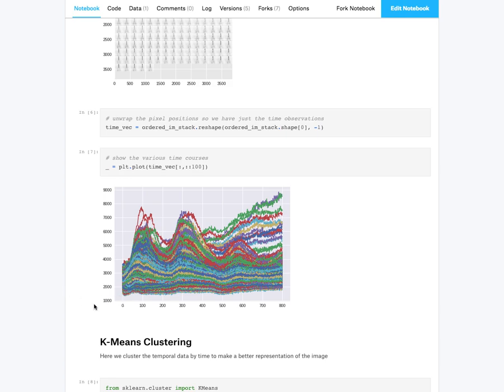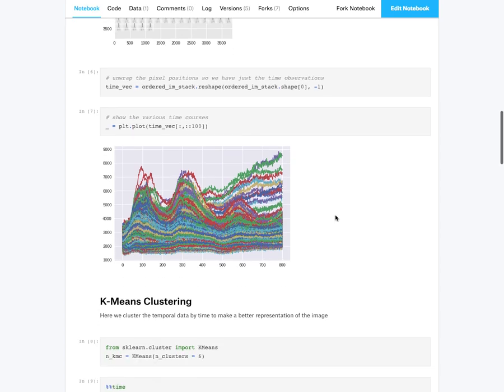And so here I think we just show the point number, but obviously this translates to hours. If you're looking at something like circadian rhythm, you want to know which curves are in sync with each other, which ones have a phase delay, because that probably means this circuit could be activating another circuit, and which are doing something else entirely, and so are probably not interesting for our analysis.